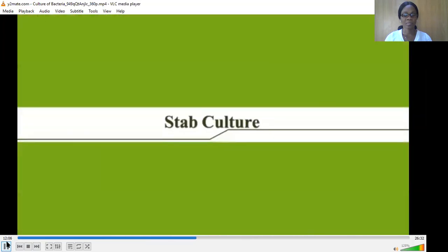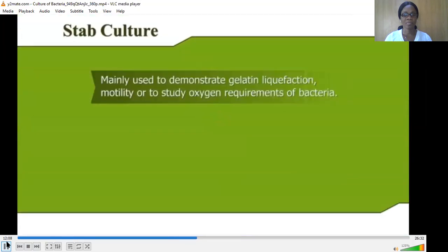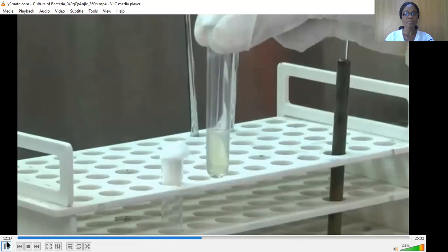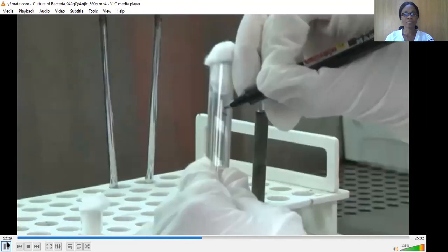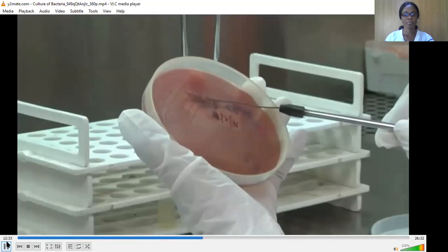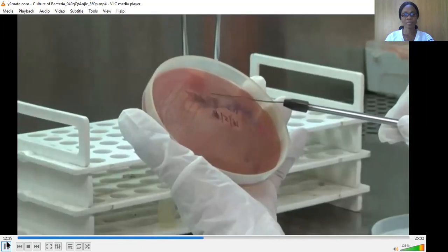Stab culture. This method is mainly used to demonstrate gelatin liquefaction, motility, or to study oxygen requirements of bacteria. It is also used to prepare stock cultures. It is performed by puncturing a suitable solid medium with a loaded inoculating wire. Take a tube or bottle with an agar medium and label it before inoculating. Load the inoculum onto a sterilized inoculating wire.